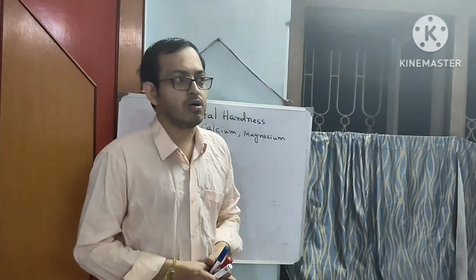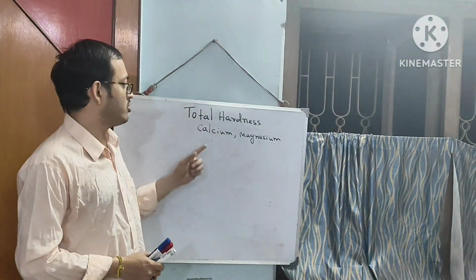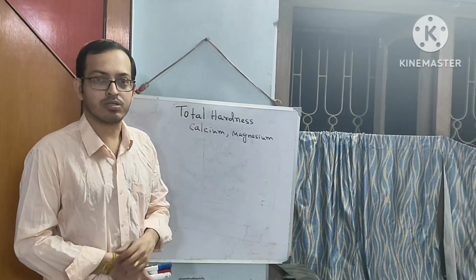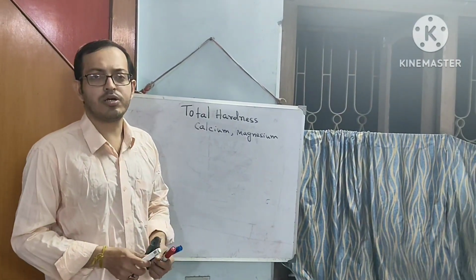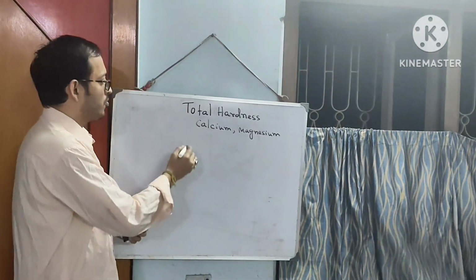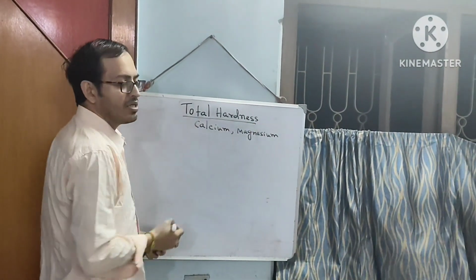Hello everyone. Today we are going to discuss the methodology for determination of total hardness, calcium and magnesium from any sample water. So we will follow the standard protocol of APHA 2005. So first of all, total hardness.